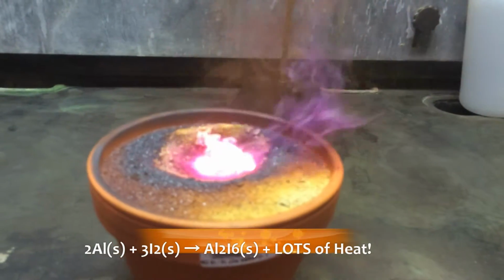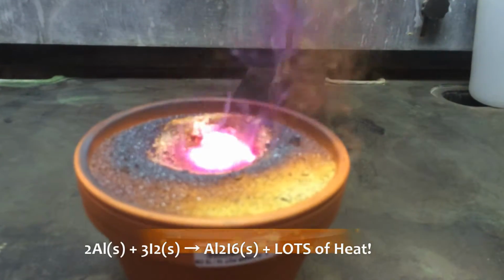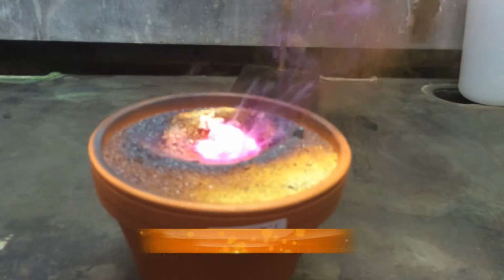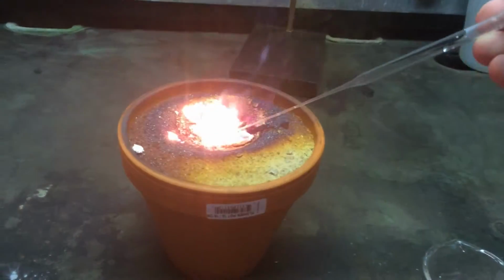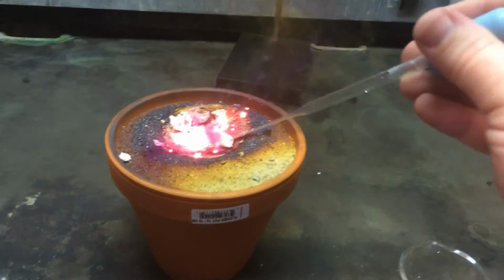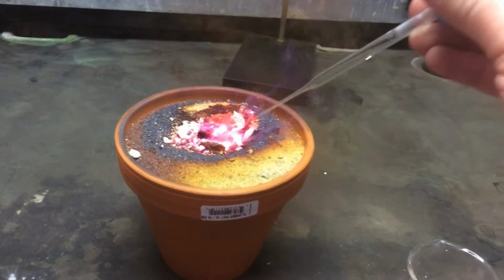Now there is one other cool thing you can do with this when it stops burning, because this is actually dependent on surface area, and when you put it in a lump like I did, there's not a lot of surface area. So when you break it up, you're creating more surface area, and you can get the reaction going again, like that.